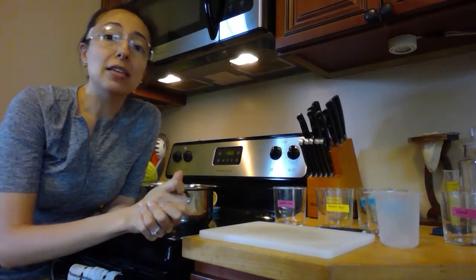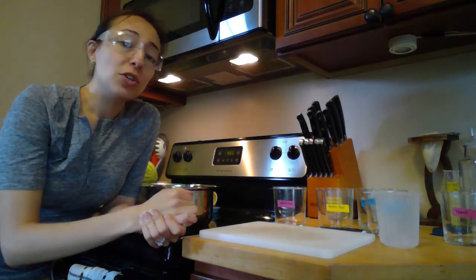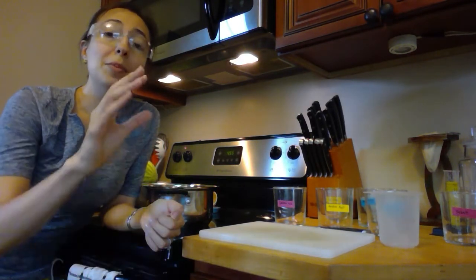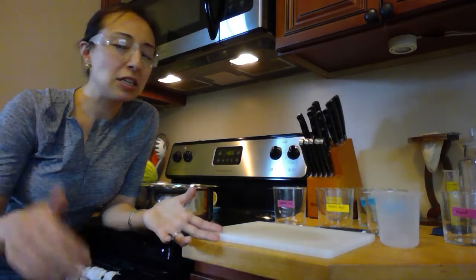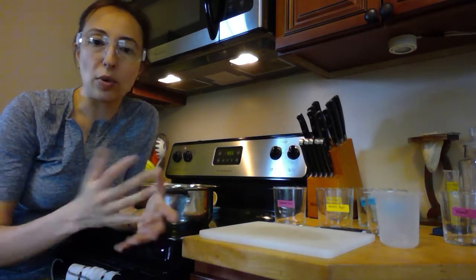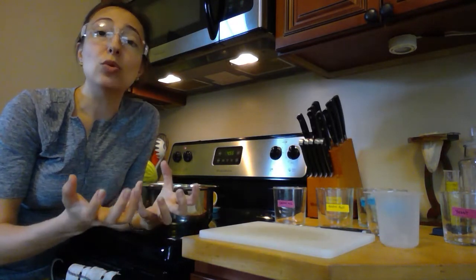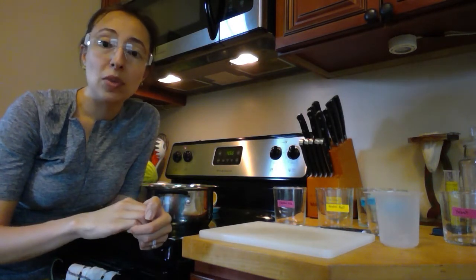And what I mean by that is, say you use bleach, something that's very strong, you want to make sure that when you pour it down the sink, you rinse it with a lot of water to help dilute it as it goes through your drains, so it doesn't do any damage to the drain, to the sewage pipelines, to the waterways. So if you have strong acids or strong bases, the best way to get rid of them is going to be to rinse them down your sink with a whole lot of water.